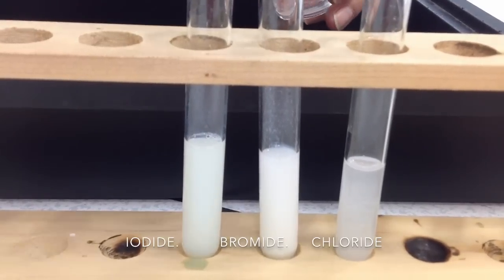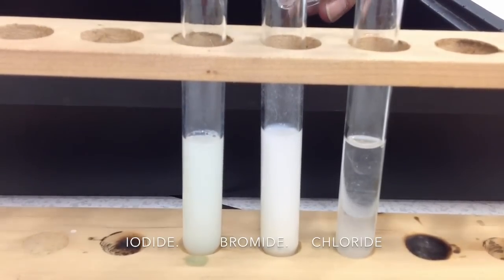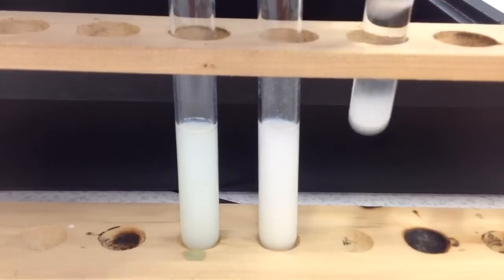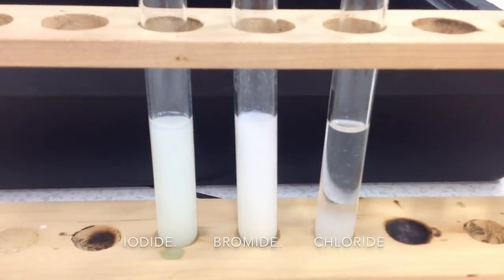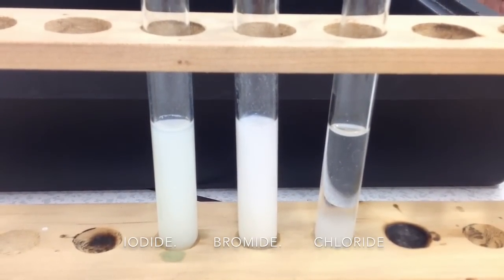So add a little tiny bit more, just to make it fair. And you can see that the chloride is soluble in the dilute ammonia solution.